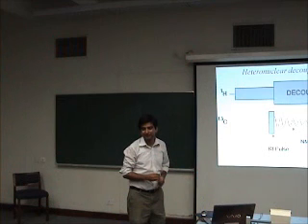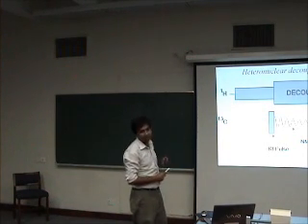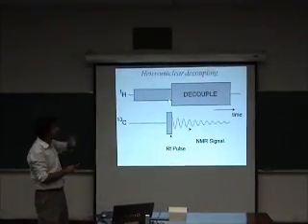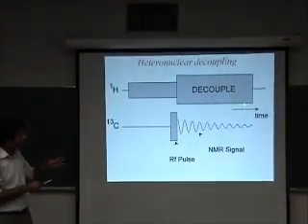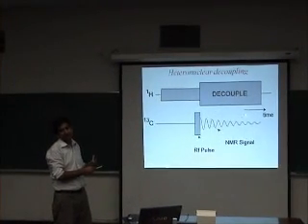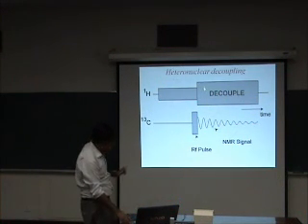When decoupling happens, the time average Hamiltonian does not have this coupling term. Now in decoupling, what happens is that you are applying a pulse on the proton. That is, you are randomizing or scrambling the spin polarization of the proton. Now half of the time the coupling is plus IZSZ and the other half it's minus IZSZ. So on average there is no coupling Hamiltonian, and that is why the carbon appears decoupled. So exactly this is the scheme. On average there is no coupling.